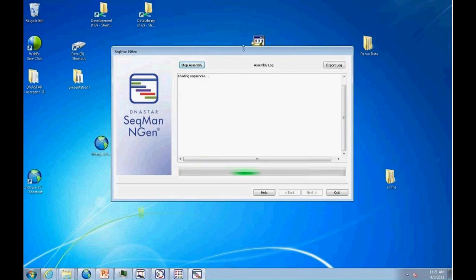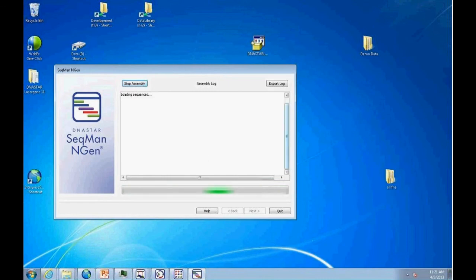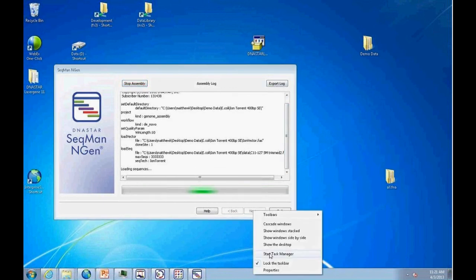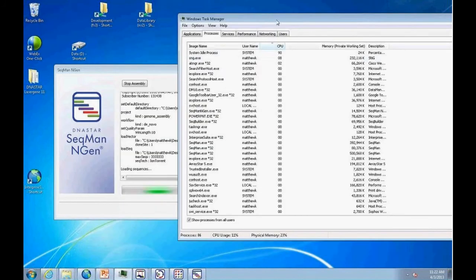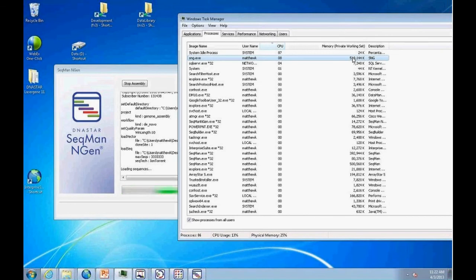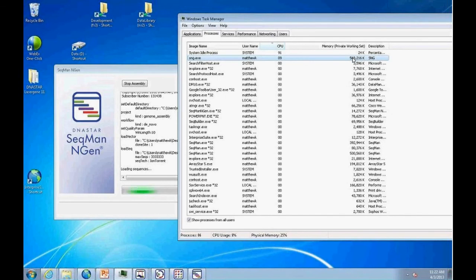Clicking assemble starts the process. Watch the log for red errors, which can be exported and sent to DNA Star. Also keep the activity monitor open — the assembly process appears as 'SNG' and you can watch RAM use. On a 16 GB machine, a microbial genome assembly typically uses less than 8 GB of RAM. If the data is problematic and assembly isn't converging, RAM usage can spike; once it runs out, performance drops dramatically, so you should restart with limited input reads.